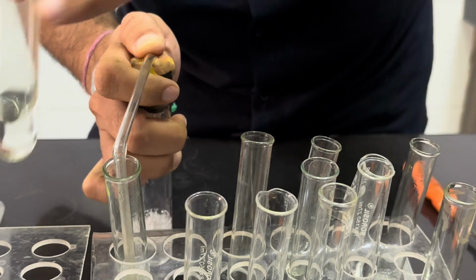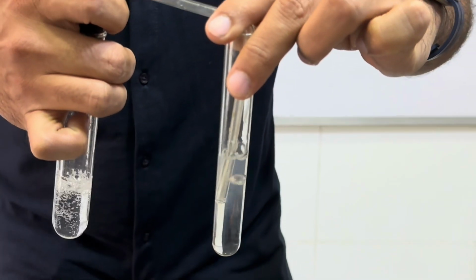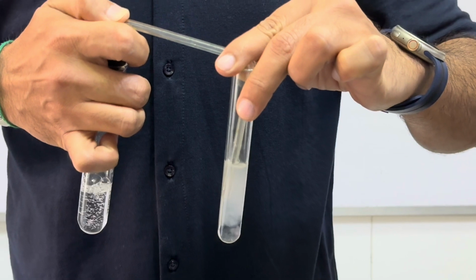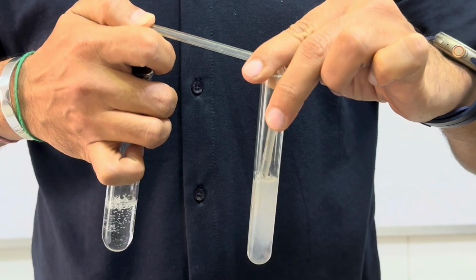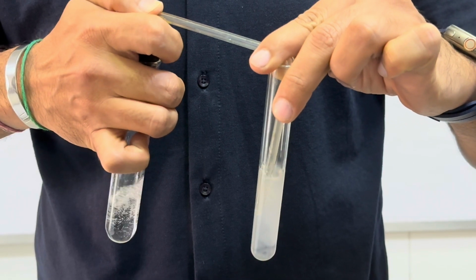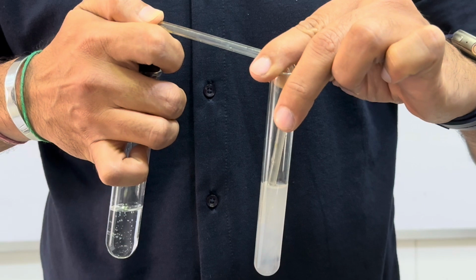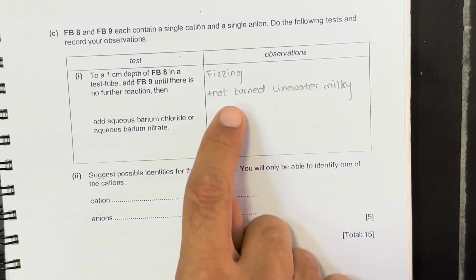So we can see bubbling and the liberated gas is coming into the tube, which is turning the contents milky white. The transparent solution became milky white, confirming that the gas is carbon dioxide. So we will record this observation. Now we have recorded this observation.